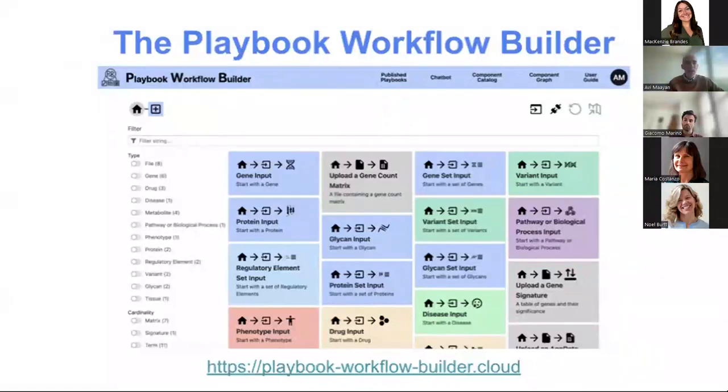This is a CFDE partnership, again led by Daniel's work, coming up with this idea of taking the APIs from the various Common Fund programs, as well as many other sources and tools, and creating this network of microservices that can be chained to build workflows. So this is the graphical user interface bioinformatics workflow engine that I would like to quickly demo.